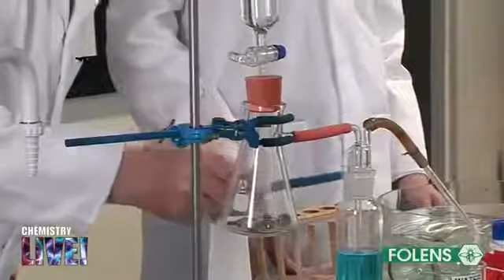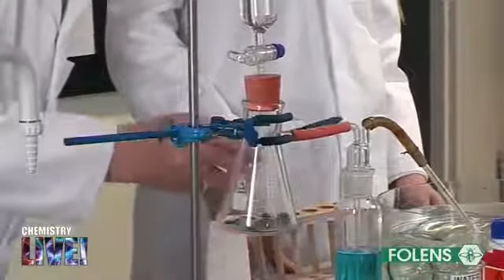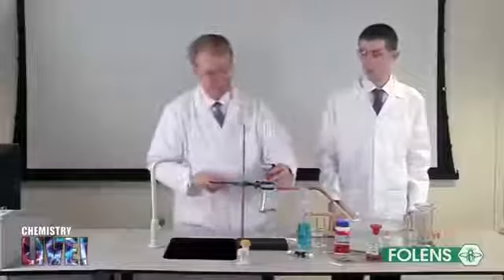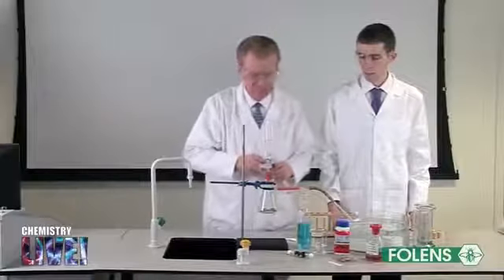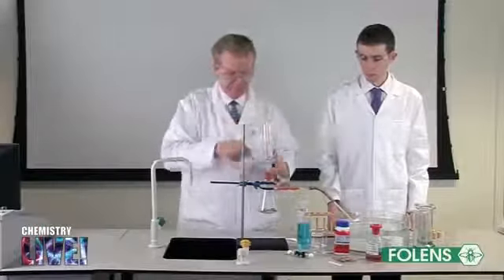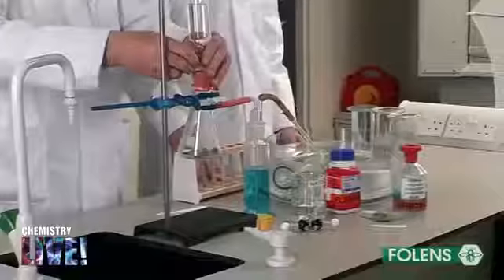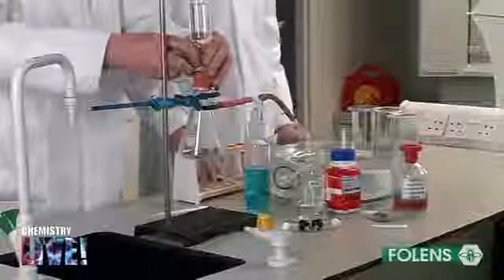Double check that you have connected the gas washing bottle correctly. Using the dropping funnel, add water slowly to the calcium carbide to maintain an even, not too vigorous evolution of ethine.